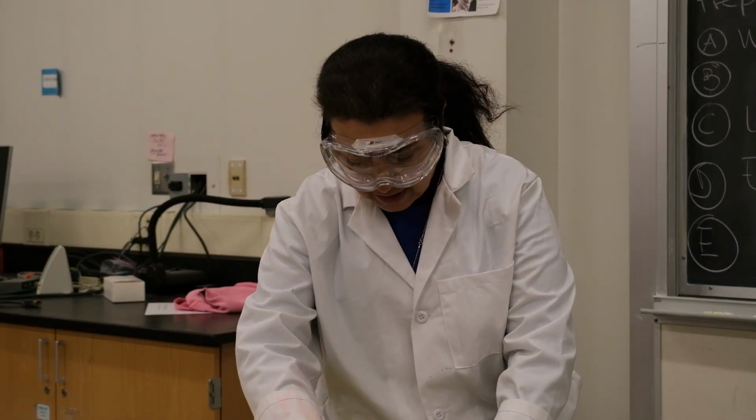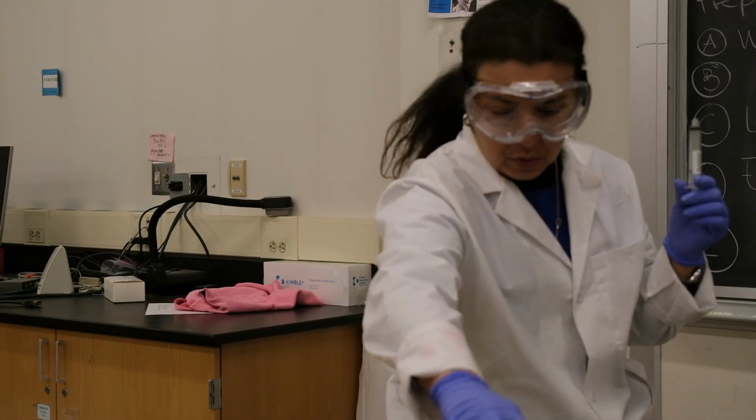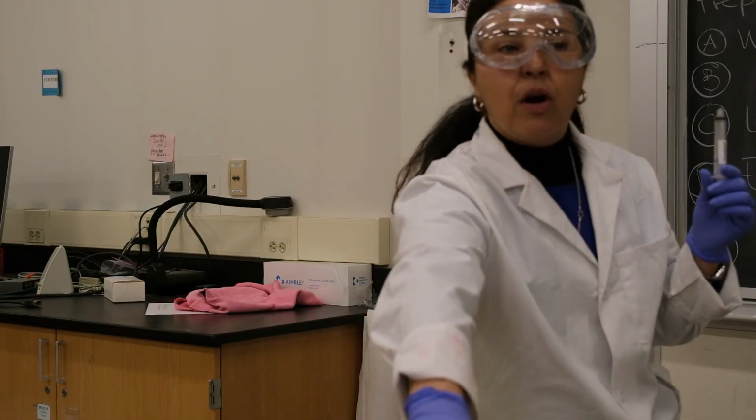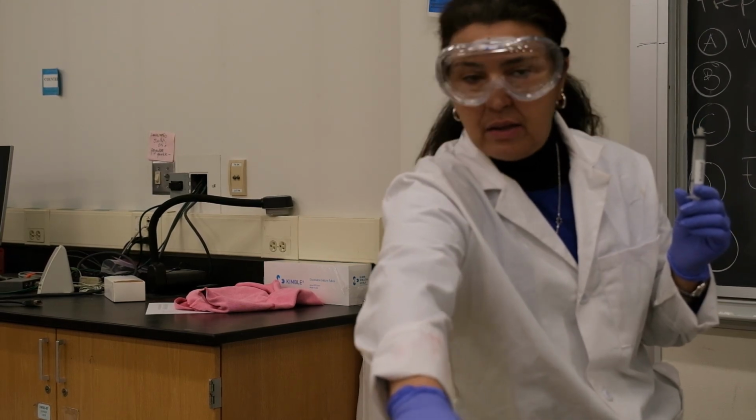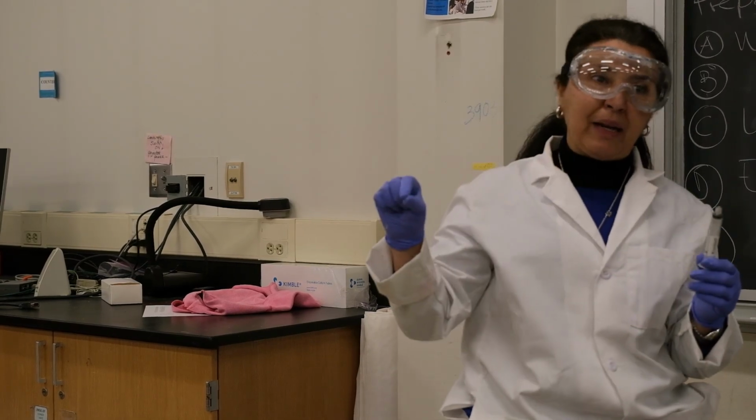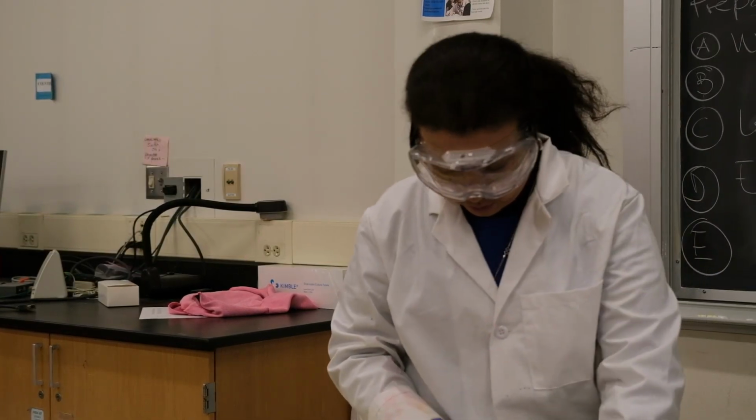And then 1 syringe with the Kool-Aid, and you choose if you want to use the grape or the one from the recipe of the student, okay? It's up to you. You have to write down which one you're using.